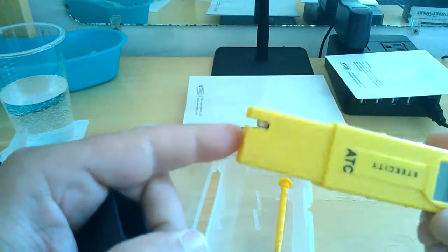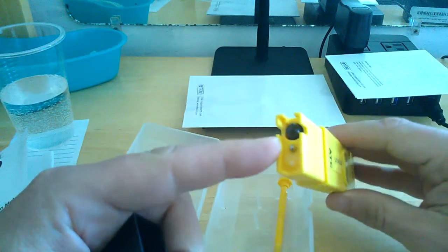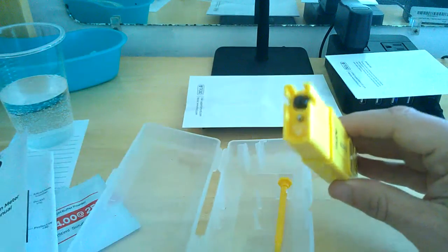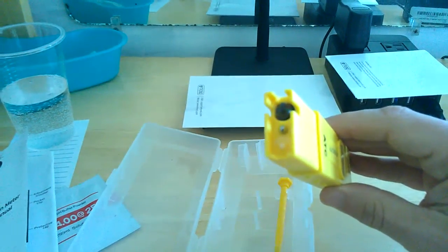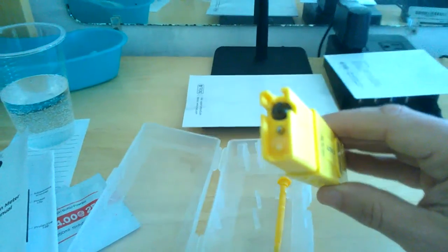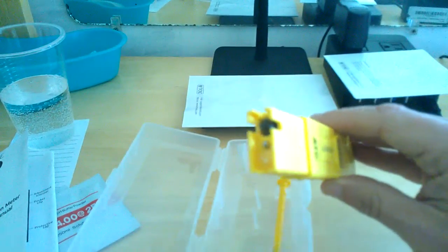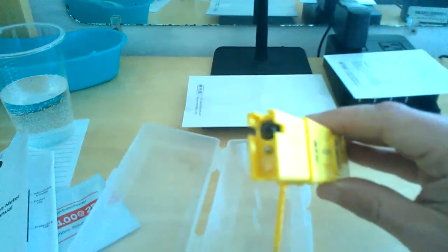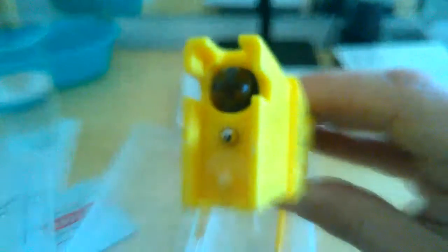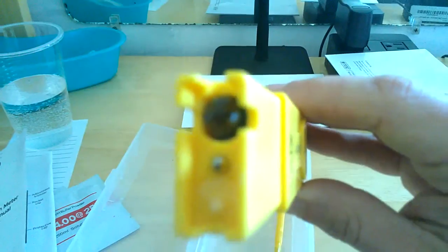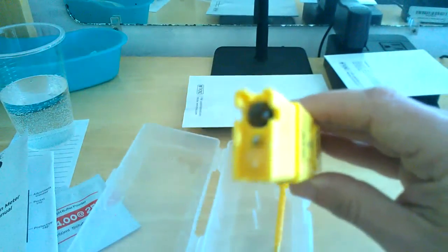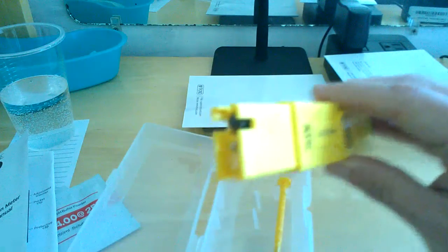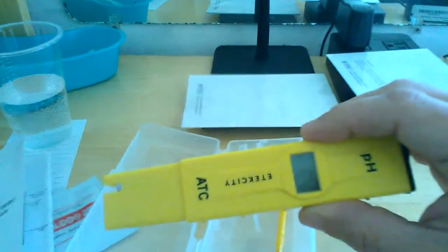Pull this off here. As you can see there, there's a little glass bulb in there. That is your cathode. I'm trying to get this focused in a little bit for you guys. Sorry about that. It looks like it's probably not going to do it. My phone's really picky. You can see your cathodes and your sensors up inside there. Very compact. Very nice design.